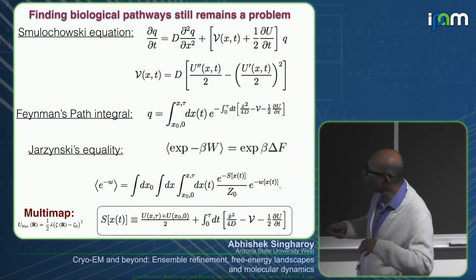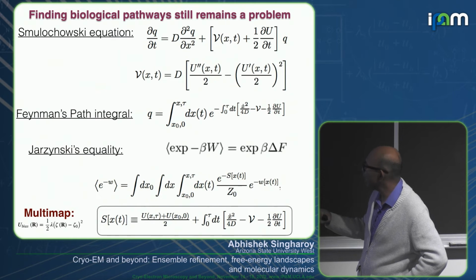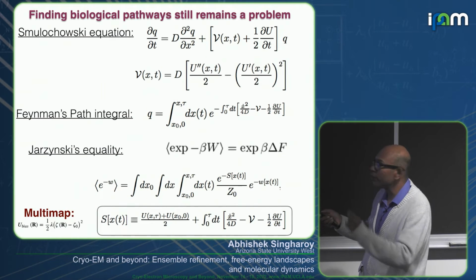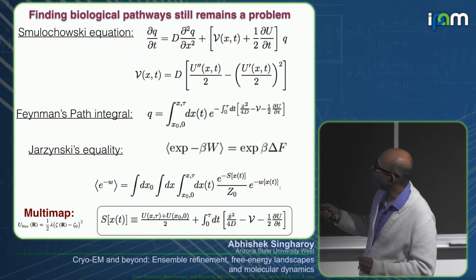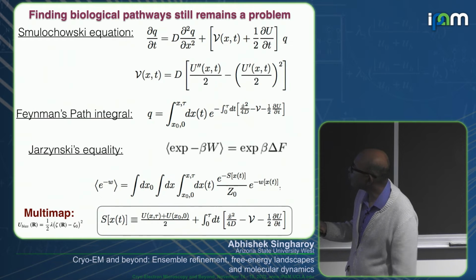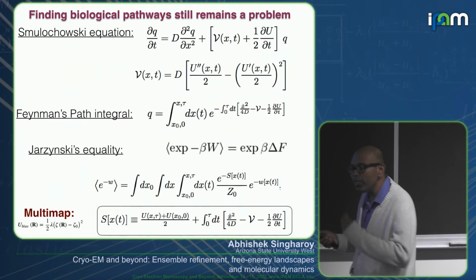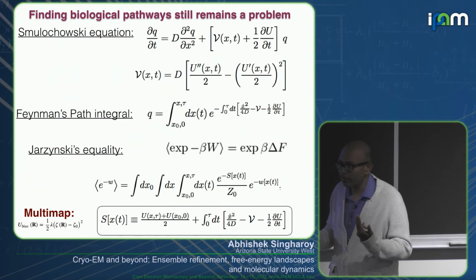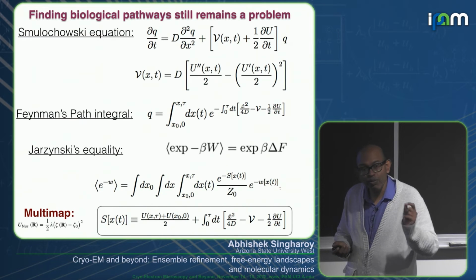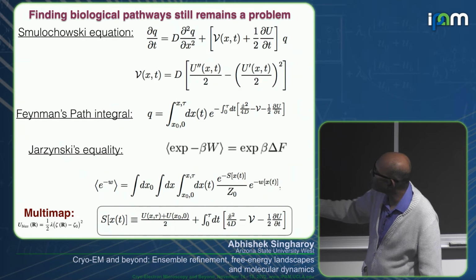So essentially, if you want to really move on the surface, you can actually solve this equation, and you can get to the surface. Actually, a form of this equation I've shown you for diffusion maps. In that diffusion map, we have seen an eigenfunction solution of this particular problem. Now let me show you a Feynman path integral solution of this problem. So if you consider time to be a continuous variable, which was Feynman's discovery, and in fact he even worked on imaginary time, then you can write the solution Q of this partial differential equation in this form.